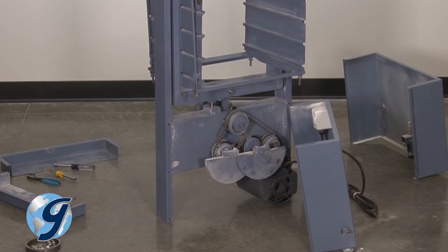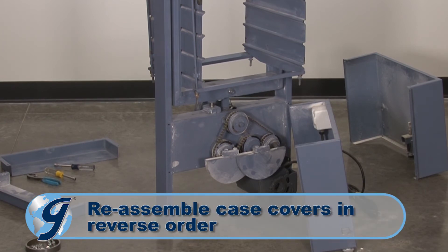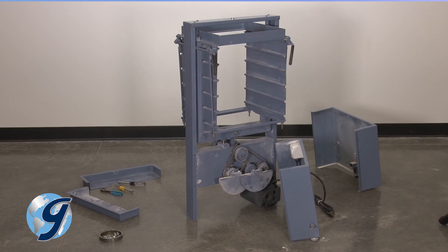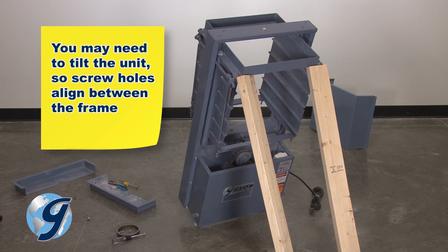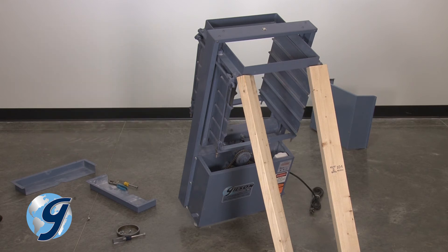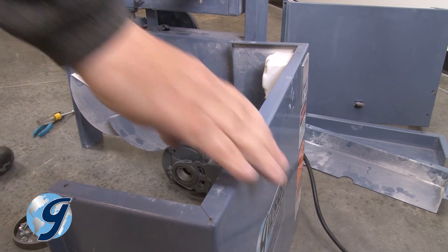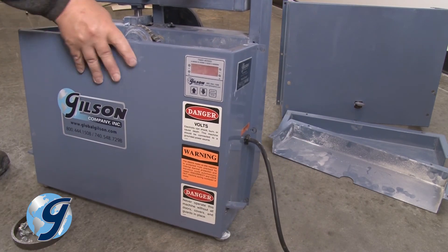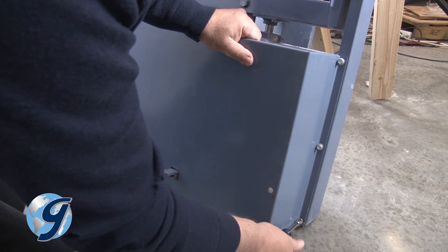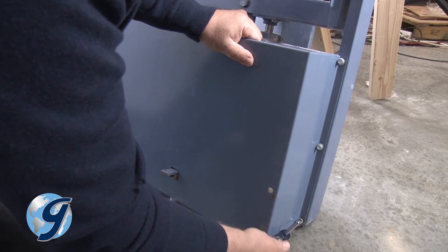To attach the case covers on the PortaScreen, assemble in reverse order. Please note that since the unit is sitting on its mainframe, you may need to tilt the unit so the screw holes align between the frame and the front and rear case covers. A second hand may be needed, or support the mainframe with bracing. Loosely screw in each screw until all screws are in place, then tighten all screws on the front and rear case covers.